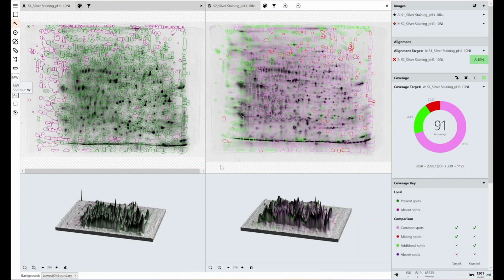And it works using the same mechanism. It works based on the molecular weight and the isoelectric point of the protein. And in fact, when people are saying, oh, well, we can identify the peptides and the proteins within our mixture using mass spec, that's not completely true.